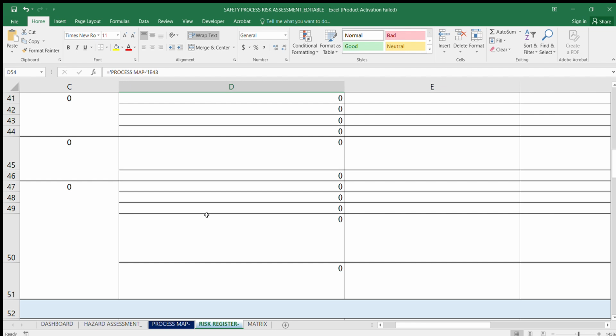Same applies to your hazard assessment. Of course, in the hazard assessment, you need to do your hazard identification. Then after that, you do your hazard characterization. Then there's that part where you're doing your personnel assessment. It is the personnel assessment as well as the characteristics of the hazard that will tell you something about the inherent likelihood and consequence, and overall risk of each of the biological agents that you identify. So basically that's that on biosafety risk assessment.